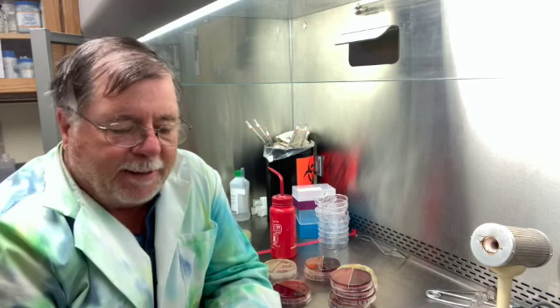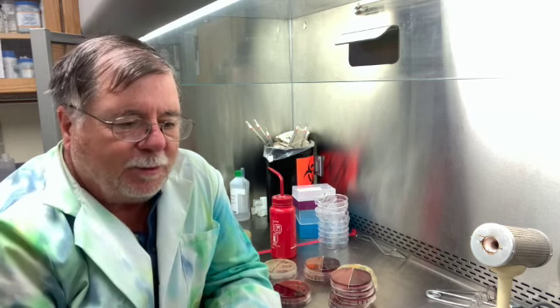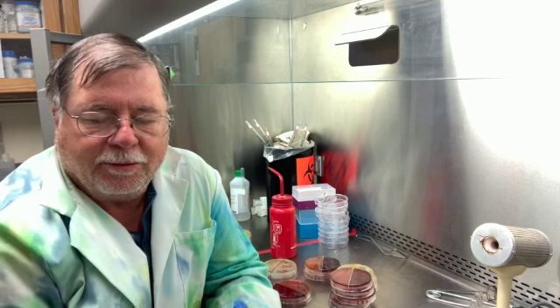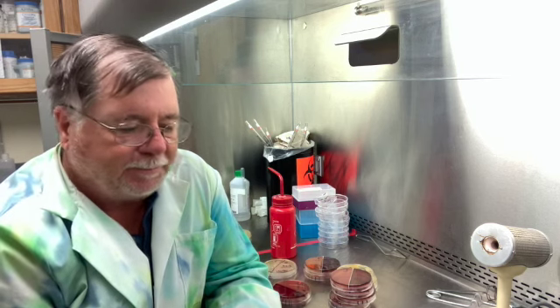And so that is one way to tell the difference between gram positive and gram negative, is to put it on a MacConkey agar and EMB agar. So you can differentiate between coliform and non-coliform, and then you can select gram negative versus not gram negative. So you pick out or select the gram negative bacteria.